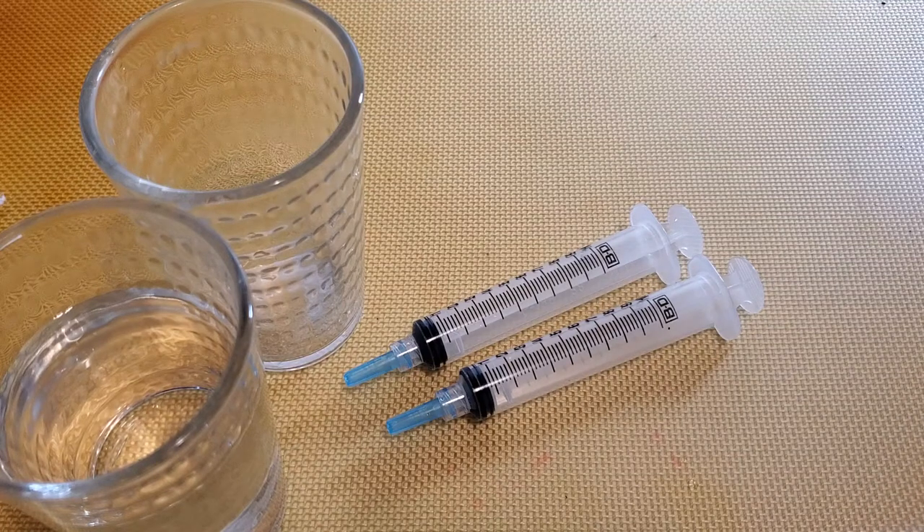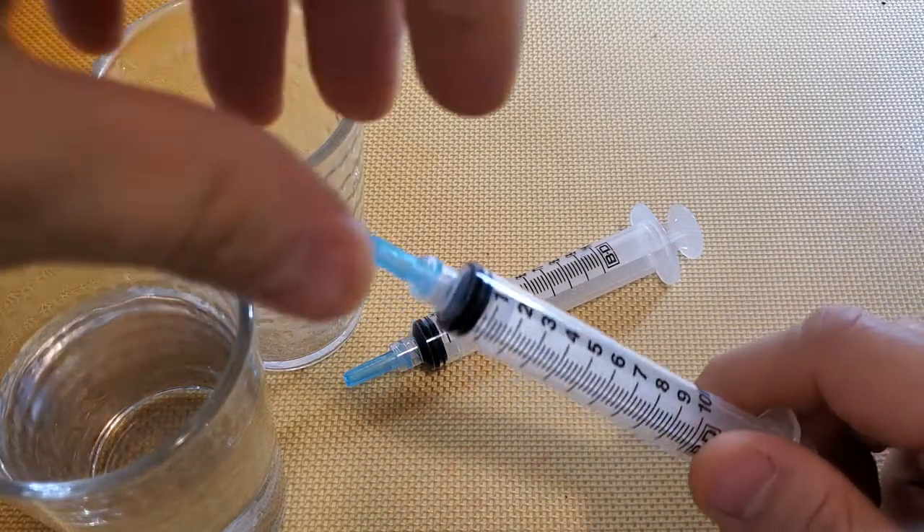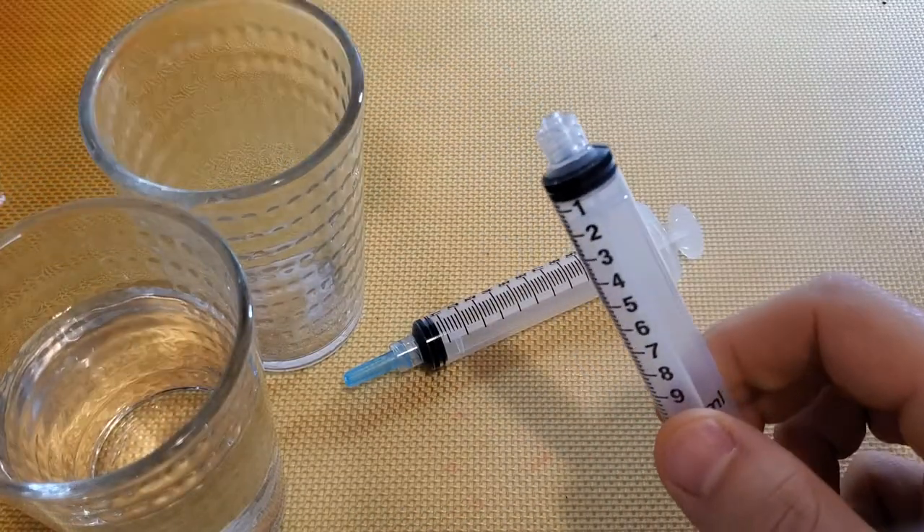Today I'm going to show you how to properly clean and sterilize used spore or liquid culture syringes. I've been using this technique for the last year with nothing but success, and hopefully you'll be able to do the same thing. One of the problems I have with mycology is the amount of single-use plastic, so hopefully this technique will be able to resolve some of that.